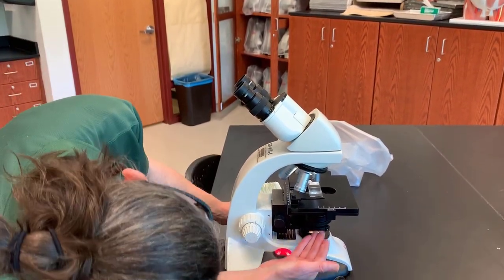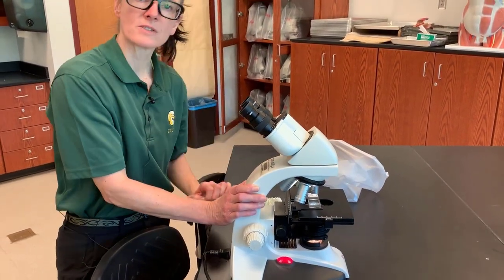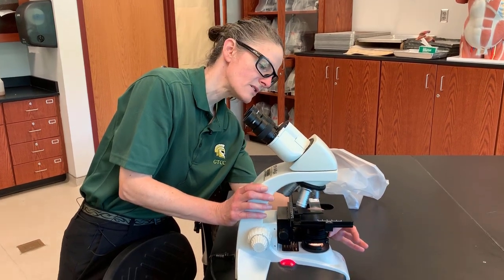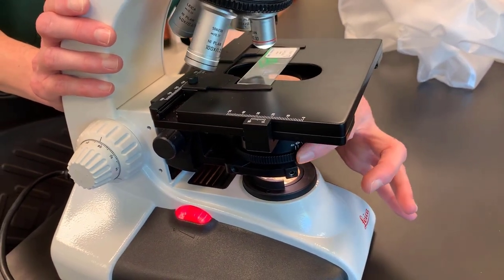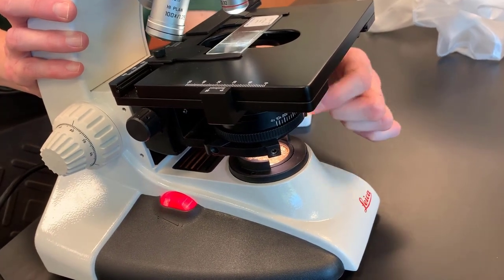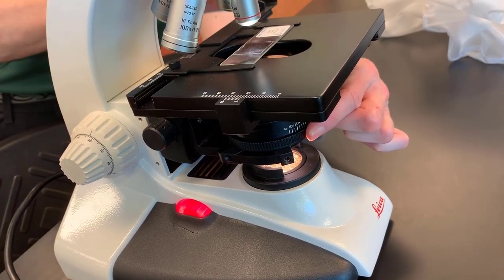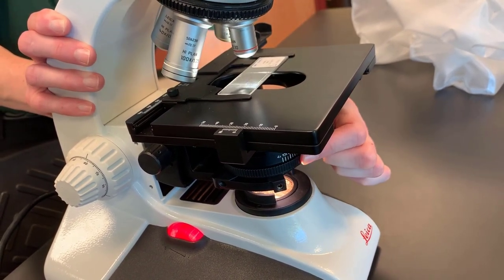The substage light must pass through a condenser. The condenser is a focusing lens that will focus the light through the slide. The condenser will have what is called an iris diaphragm, which can change the amount of light that passes through the condenser lens. We manipulate the iris diaphragm via this lever — sometimes it's just a knurled ring, sometimes it's an actual lever called the iris diaphragm lever. You can see here how the amount of light coming through the slide changes as we stop it down or open it up.